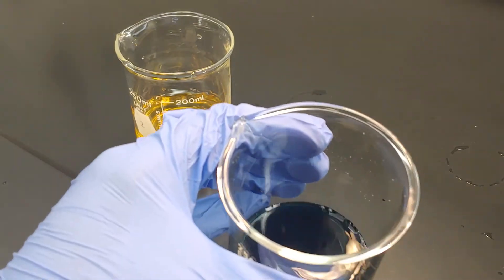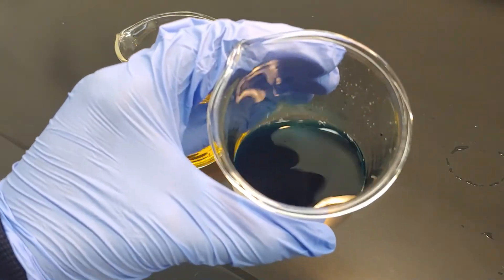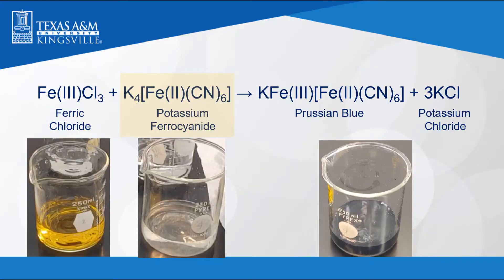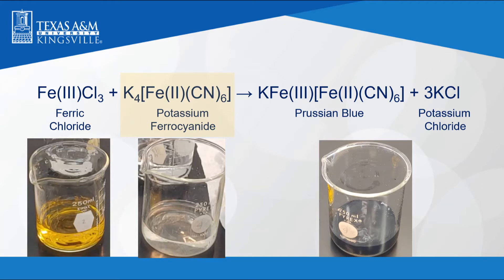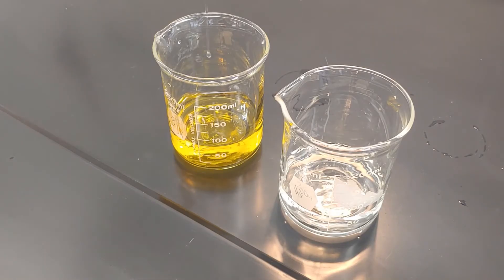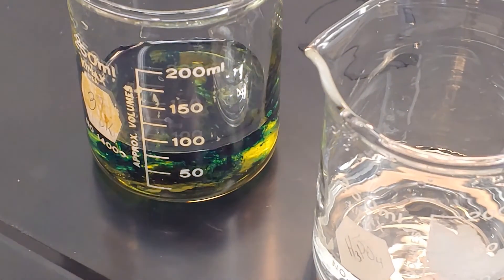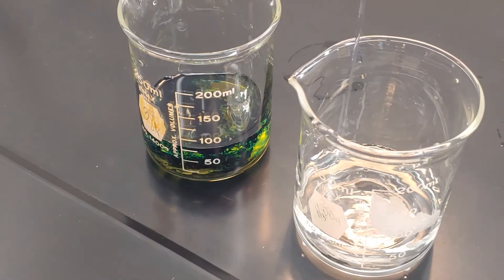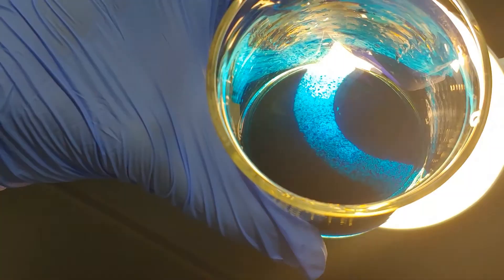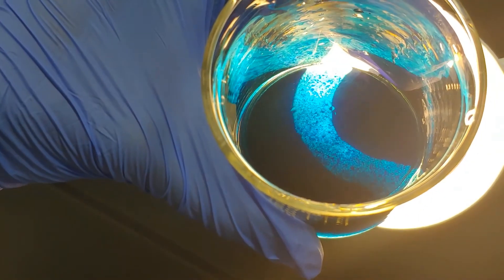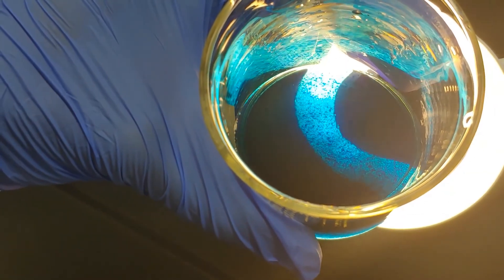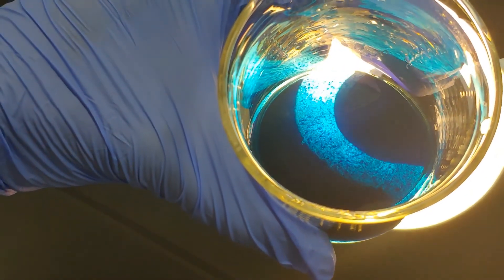So now we are going to see what happens when we add potassium ferrocyanide to an excess of ferric chloride. As you can see here, especially with the help of the light, the solution is not completely dissolved.